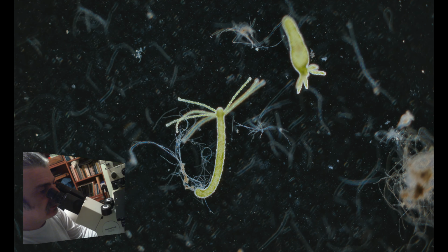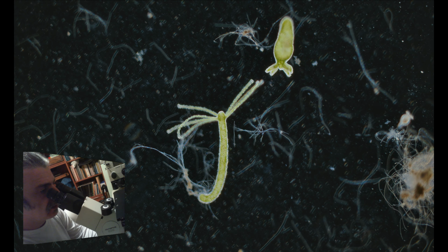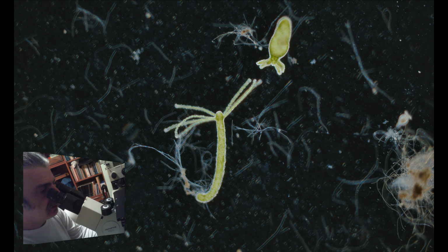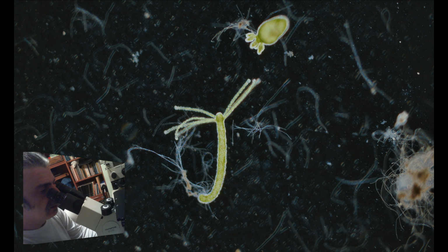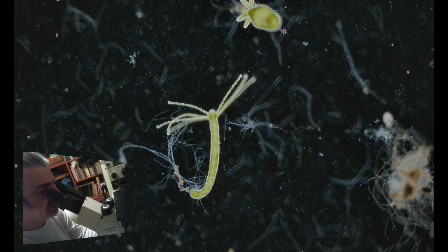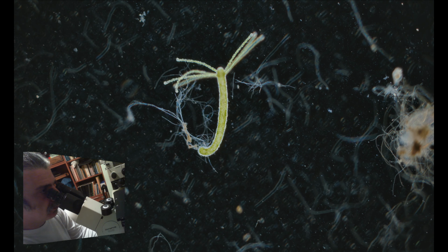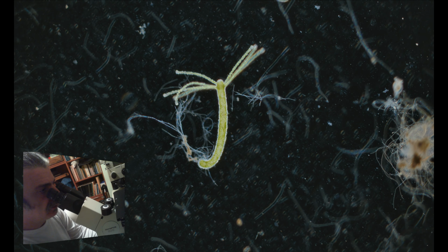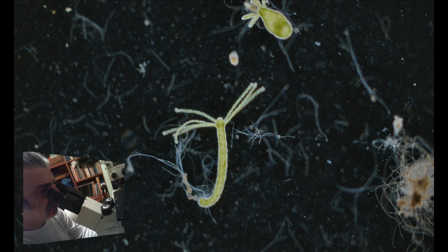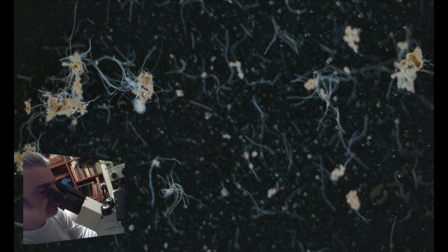Here is one that spreads. These are green hydras that harbor algae inside them, which gives them their green color. We'll see all of these creatures in great detail after we finish the initial scan with the small magnification.